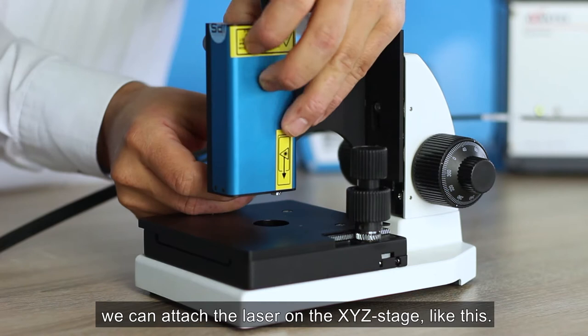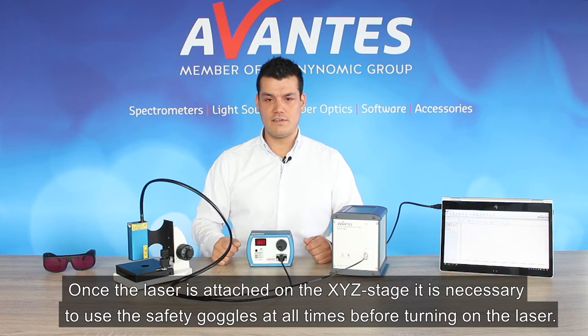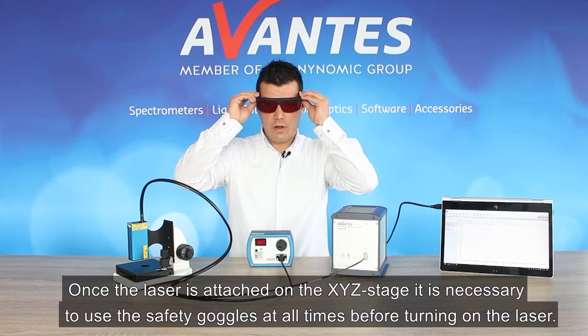Once the laser is attached on the XYZ stage, it's necessary to use the safety goggles at all times before turning on the laser.